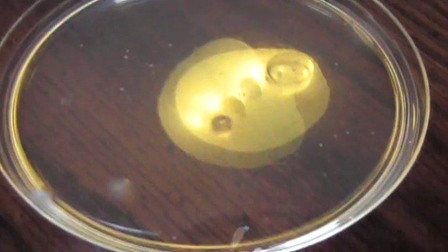Now this is what it looks like after. And it looks clean. Pretty clean. There's a little bit right there. There's a couple little dots there. Nothing too bad, though.